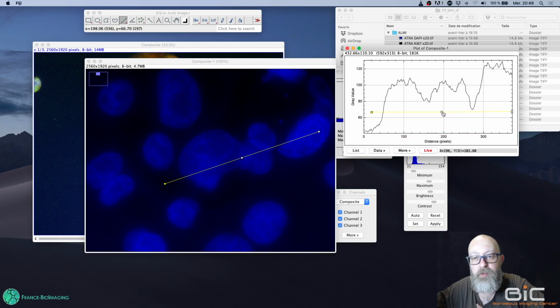So you would raise surely a bit the minimum intensity to be considered as pixel belonging to nuclei. It would be okay for that one, which would be separated from this blob containing this, this, and this, so 3 nuclei, and it would be separated from the other nucleus.